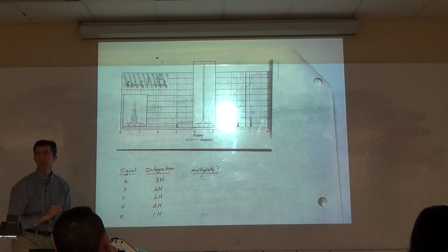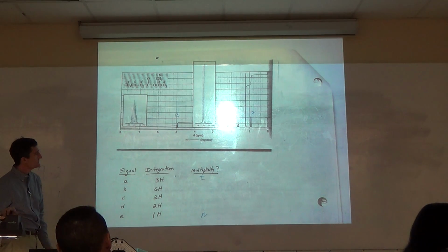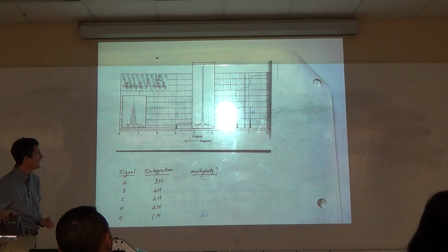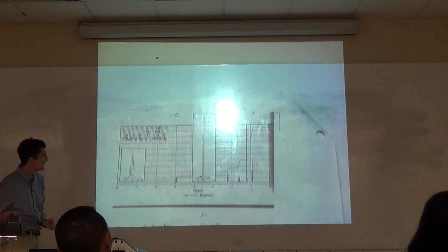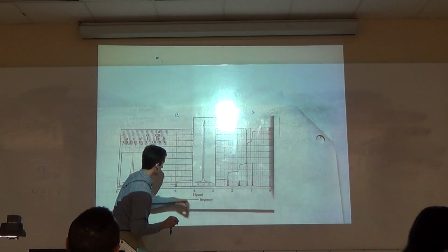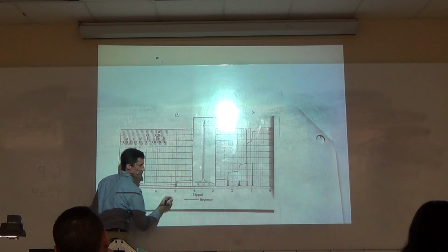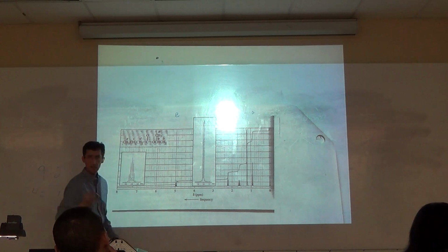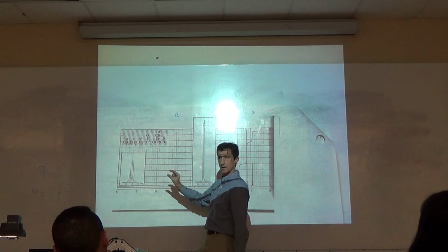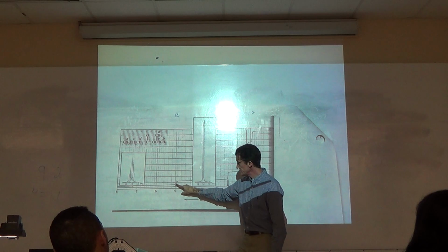Okay, I see now. I really wanted to do integration first because we don't know which signals these are. Let's halt that. Let's assign signals based on integration. Let's use our integral curve. We measure from here to here. Instead of using the ruler, I want to use my finger gap. So that is that long. How many H's is this?